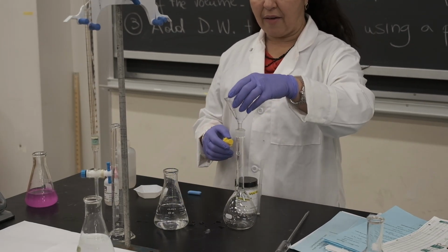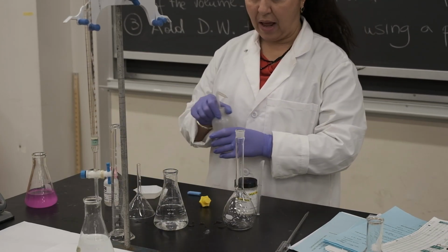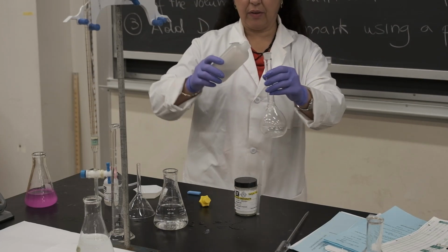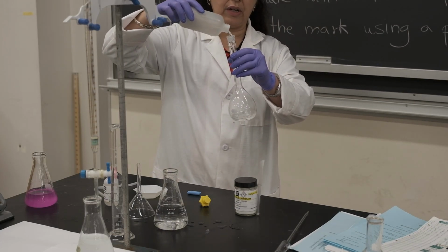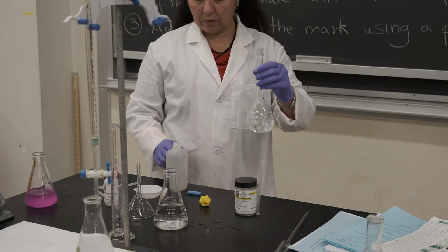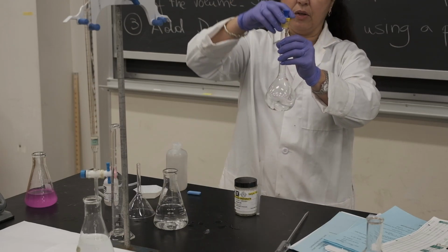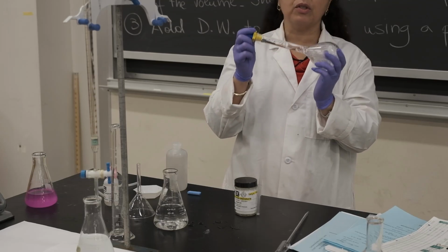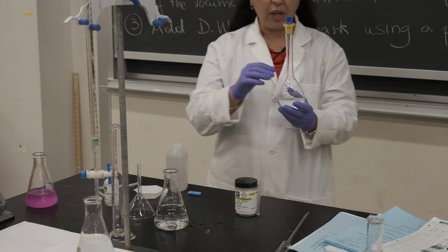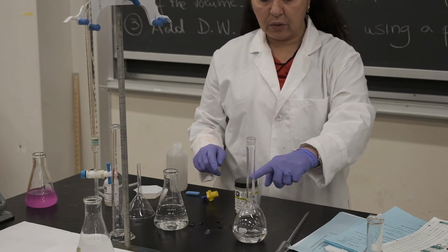Once you have added the acid to the flask, you fill the volumetric flask with water, deionized water, to about one quarter, three quarters, maximum up to here. And then you start to shake it so that you dissolve the acid completely. It takes a while to dissolve the acid. Once you have finished dissolving the acid, you add water to the mark.